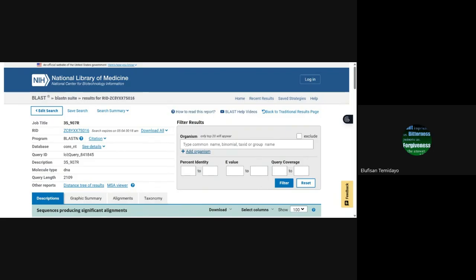So let me rename it. Let me just say the Pseudomonas training .fasta. Then I change this to All Files. Okay. So the next thing, now I've saved it. Now in this place I should have 11 sequences. So the next thing I'm going to do now is go to Mega.